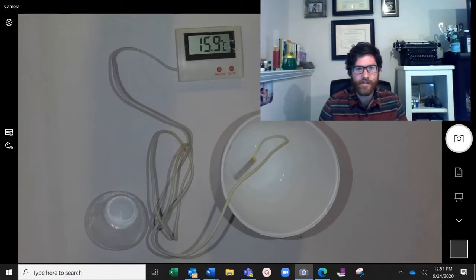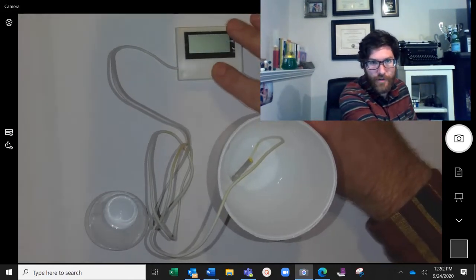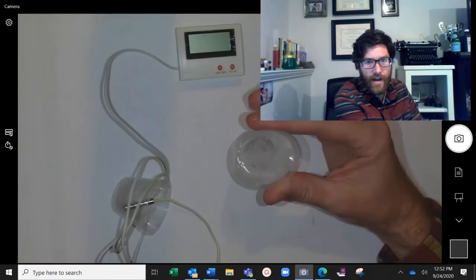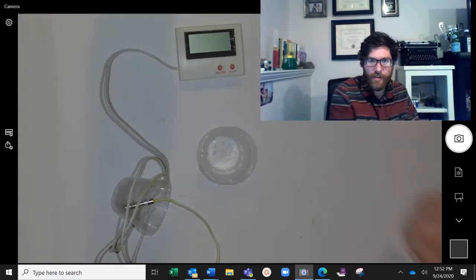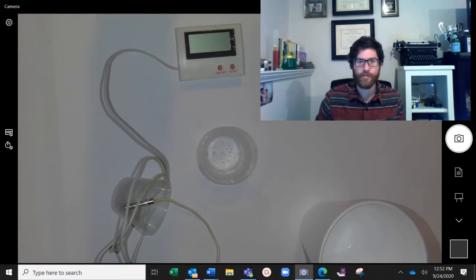Give it another 30 seconds or so to complete the reaction. And then we'll take a look at the final substance. All right, we're going to go ahead and call that our final temperature. And I'm just going to move this over to a clear cup so we can take a look at its properties after the reaction. Okay, there's a lot of bubbles still in there. And that's our reaction. Hope that was helpful for filling out your data tables.